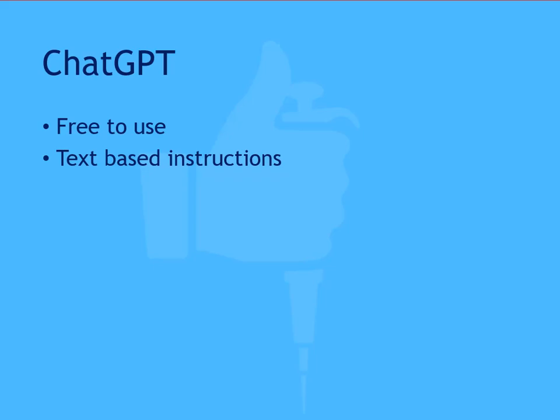All instructions must be entered as text, and there are no user interface controls for providing ELISA-specific settings such as a layout editor. In performing a series of ELISA analyses, you'll notice the analysis is potentially unreliable. Sometimes ChatGPT is unable to complete the analysis and returns error messages, even with the same data and instructions. OpenAI use usage caps, so if you go over your use allowance, you'll be blocked and asked to return perhaps in 90 minutes to resume work.